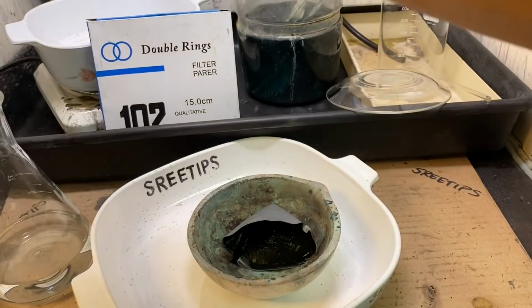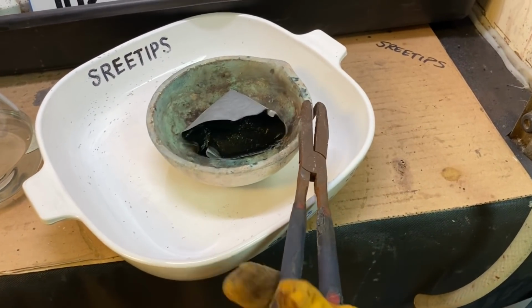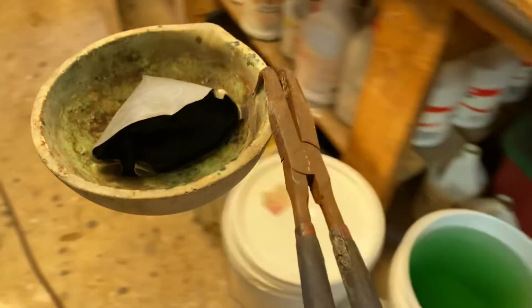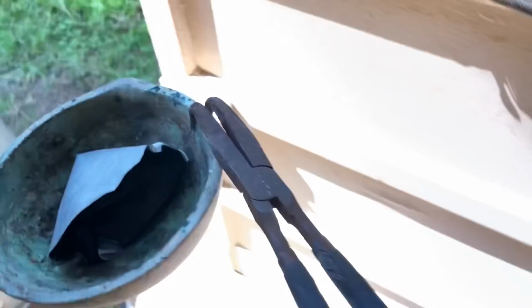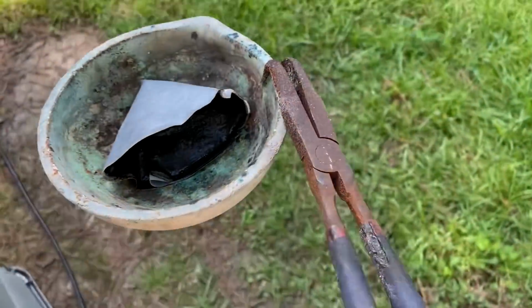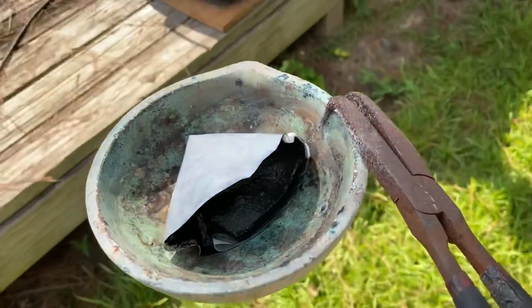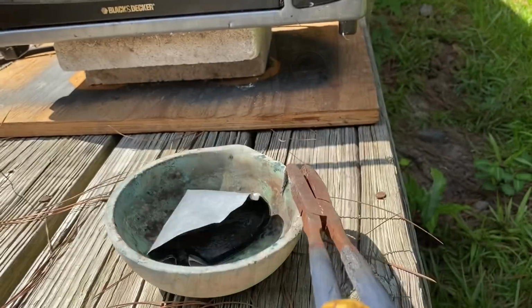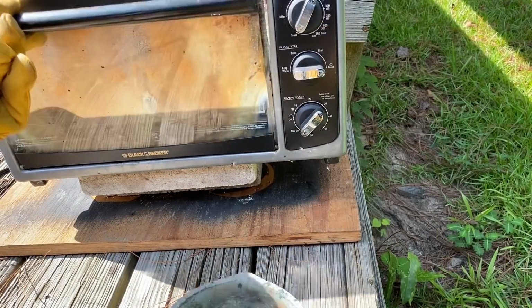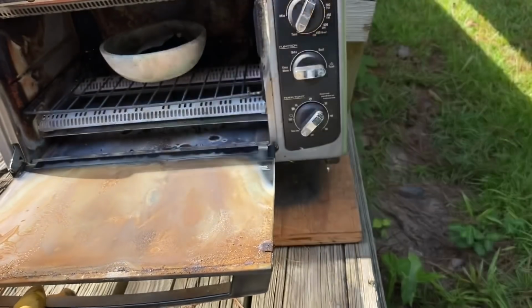All right, there we go. Next step is to take our material out here to our preheating Franken oven. I'm doing this outside because I expect some smoke to come from this burning reaction here. And we're just going to stick this in here. Oh yeah, it's hot. And let this cook.